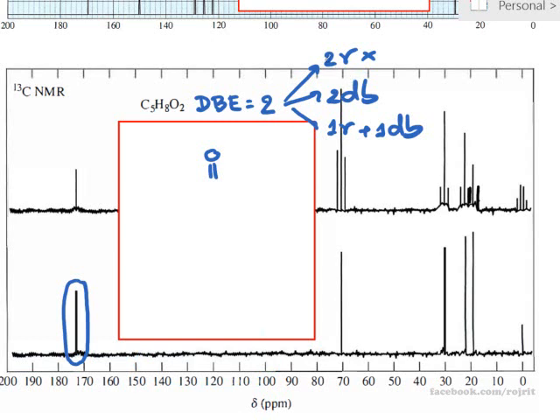So for a cyclic carbonyl with 2 oxygen atoms, there are 2 possibilities: a cyclic ketone with a hydroxy group, or a cyclic ketone with an ether, something like that. Or another possibility is the cyclic ester, because you have two oxygens, right, so it can be an ester as well.